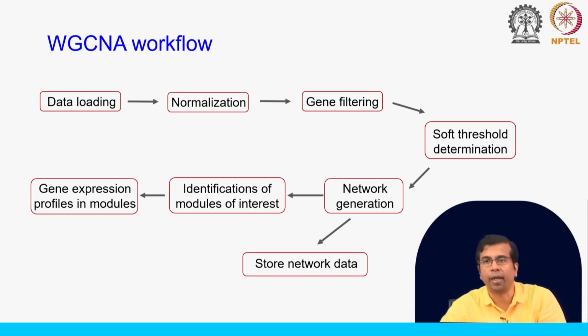So, these samples, we had 9 gastric cancer samples and 9 normal tissue samples. So, there are differences in these samples, these expression profiles that might arise because of technical variation. Okay. So, there is of course biological difference between normal samples and cancer samples, but there is also technical variation, right. When these samples were prepared, there would be technical variation that will be reflected in the data. The goal of normalization is to actually remove that technical variation, so that we can study the biological variation, right. So, our focus is biological variation, we want to get rid of the technical variation. So, normalization helps us to do that.